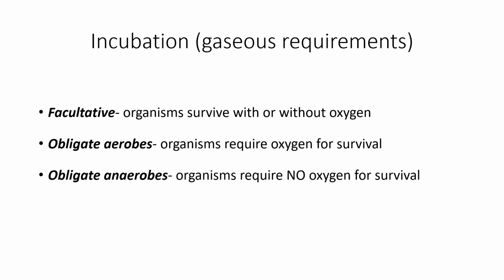There are a number of organisms that are considered to be facultative anaerobes. For example, Staphylococcus and our enterics are facultative anaerobes. They actually prefer an anaerobic environment, but they do fine and grow and reproduce fine aerobically as well. So these are called our facultative anaerobes. So usually our facultative anaerobes are grown aerobically just because it's cheaper to do so in the laboratory.